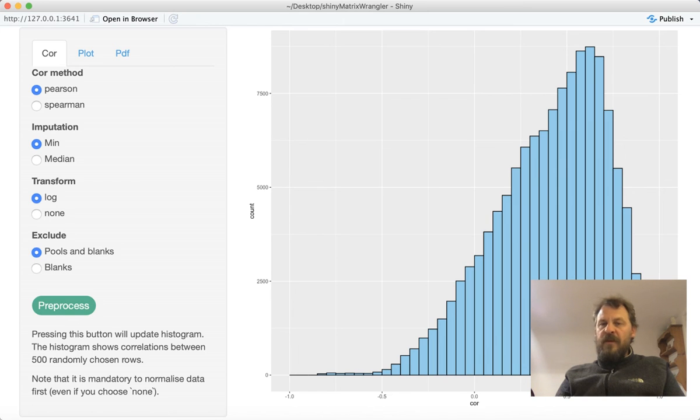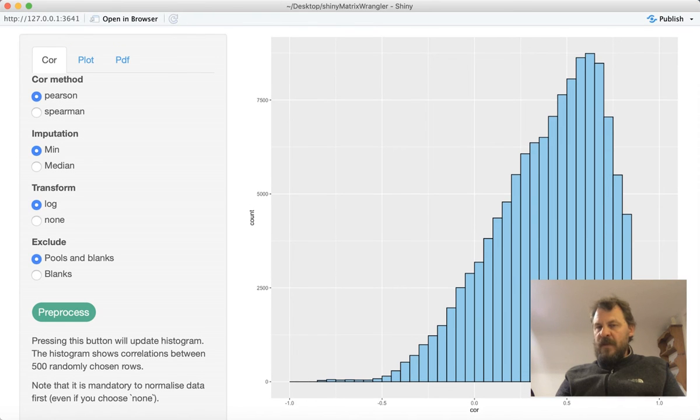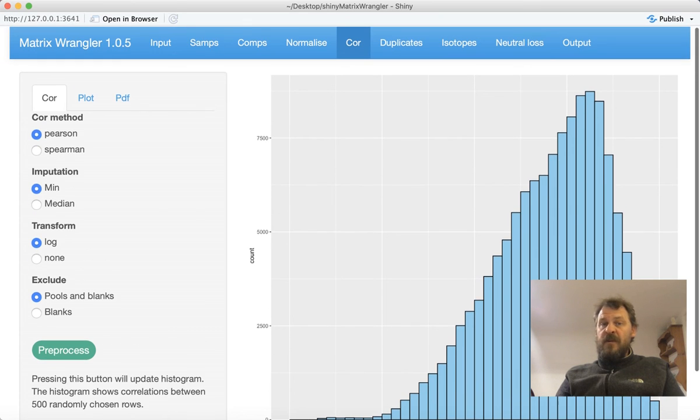The reason why they show a high correlation here is because we haven't normalized. The correlation simply follows the pattern of how much concentration in total there is per sample, and that's the same for every feature. That's why so many features seem similar to each other. So if we don't want that, we have to take one step back.